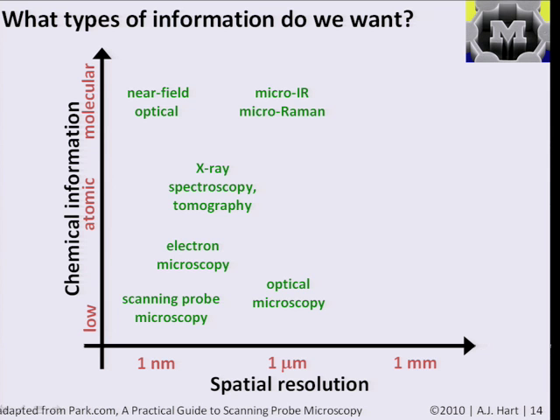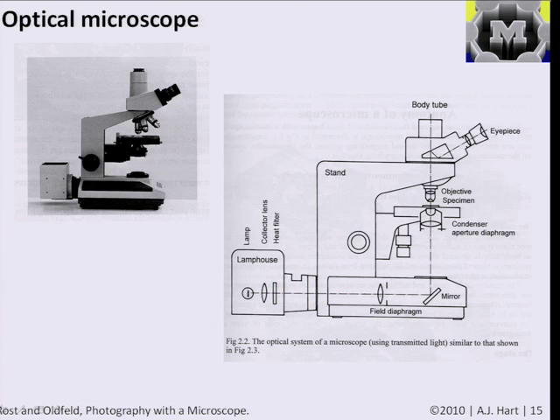And so these maps are not always inclusive, but there are often a lot of trade-offs. And if you're characterizing a material, you want to use a bunch of different techniques and know what different techniques can get you to get the information you want. So our trajectory today is going to start at optical microscopy and go down to finer and finer resolution microscopy, and then we're going to talk about X-rays, and then we're going to talk about optical spectroscopy. So you've all seen a simple benchtop optical microscope, something that you might have in a basic high school science lab.